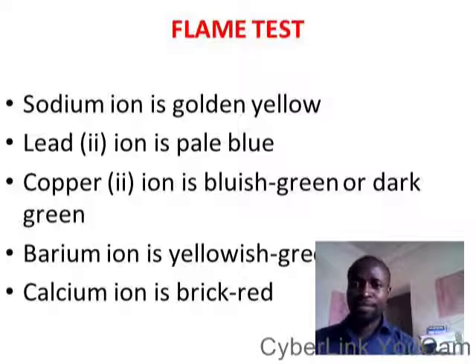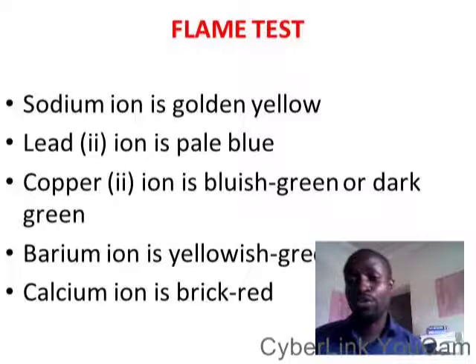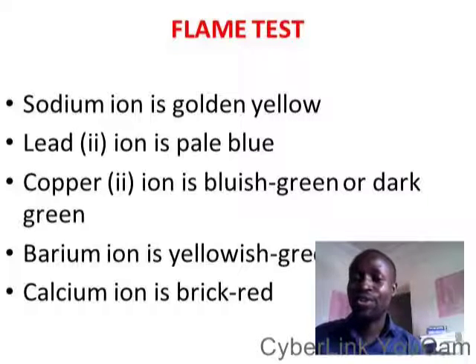What is the flame test? The flame test is a process of heating using a Bunsen burner in a blue flame to test for the presence of a certain cation. You can remember we have done a video on metallic ions that are called cations. You can as well watch that video.